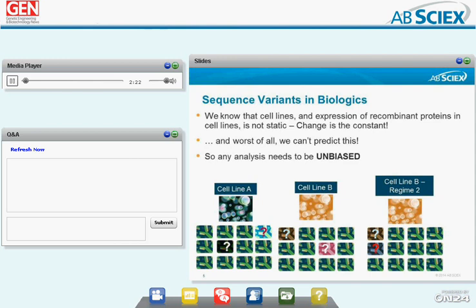And a crucial issue for us in the vendor world is that the new sequences tend to be very low in abundance in many cases, and therefore very hard to spot. So you really do need methods that find things of very low abundance amongst species of very high abundance. And this is really an issue of dynamic range and being able to measure accurately inside what is often interpreted as just noise.